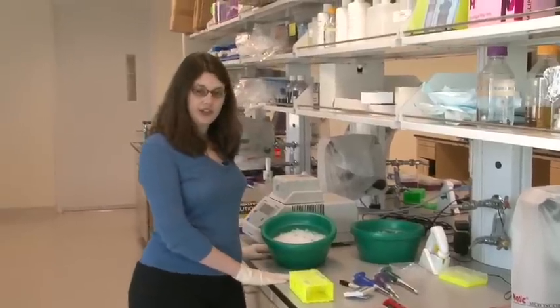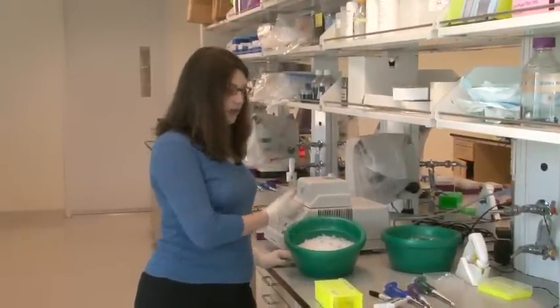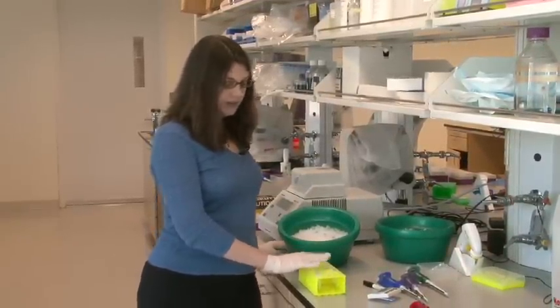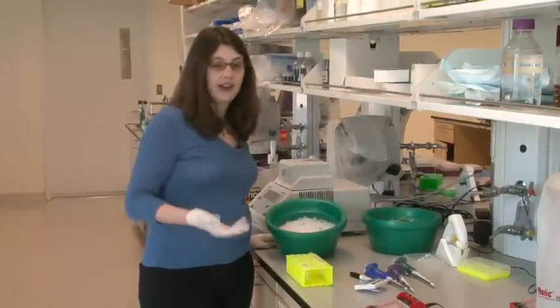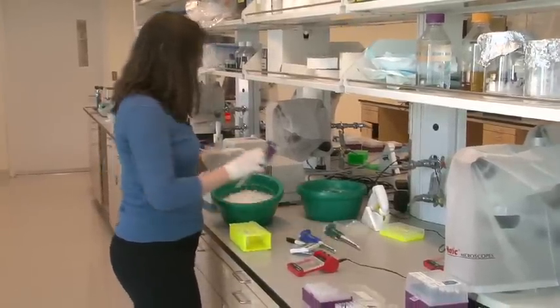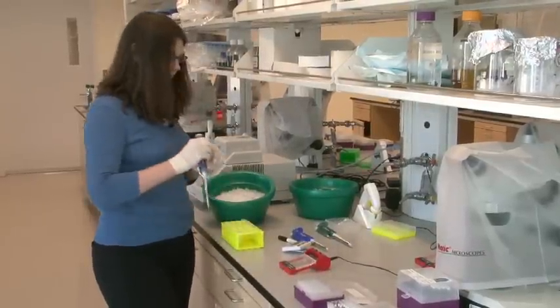So the next thing I'm going to do when the PCR reactions are done and I have my segment copied is I'm going to transfer, again, a small amount of that into these tubes right here. And in these tubes, I'm going to mix the DNA with an orange dye. This dye is going to allow me to see the DNA, and then I'll be loading it onto this gel here.